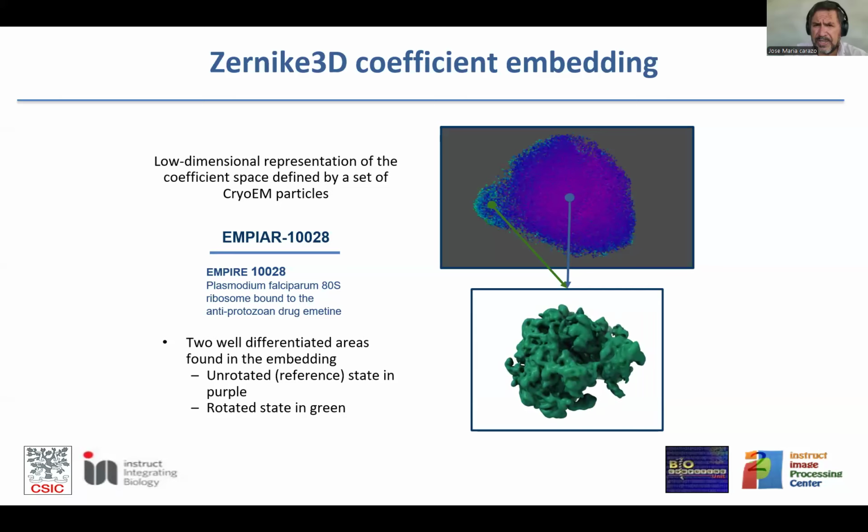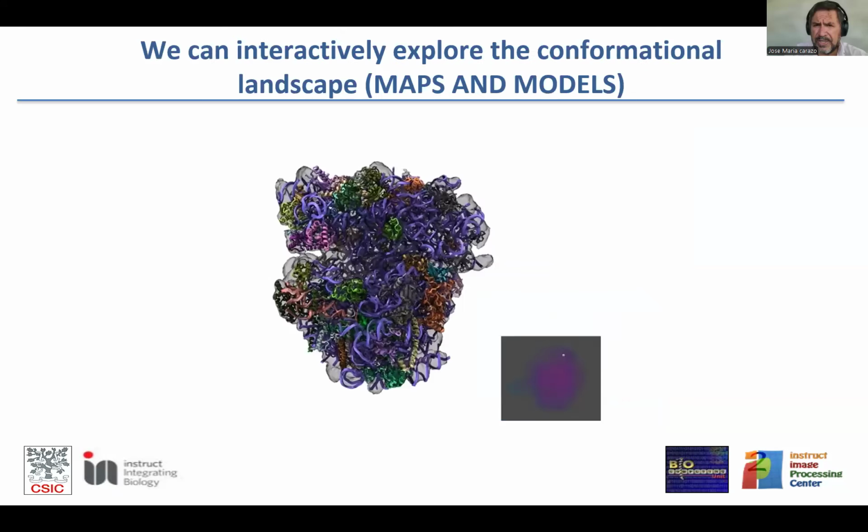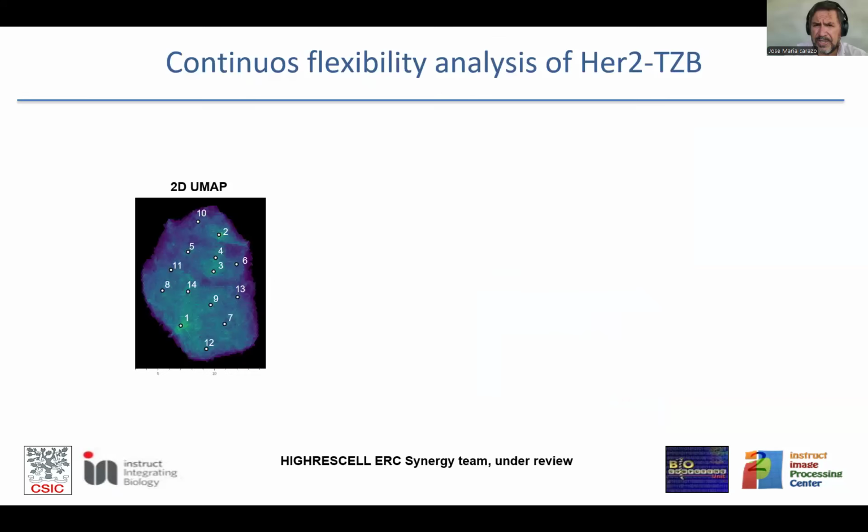We do not get information about the dynamics, in terms of time, because the specimen had the time to explore its conformational landscape, but it was frozen at a certain moment. And the freezing took milliseconds. I cannot do more. But this is exactly the same.